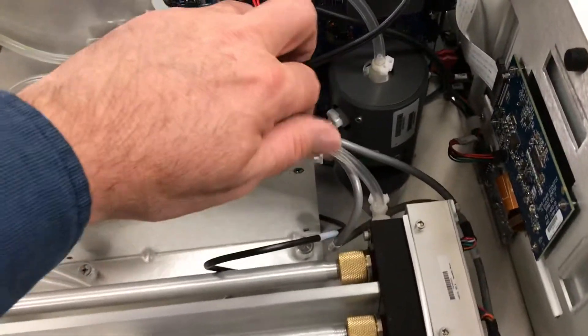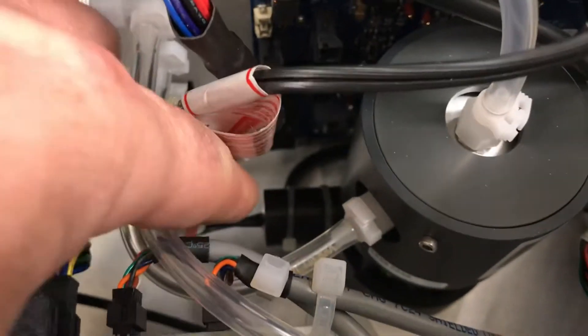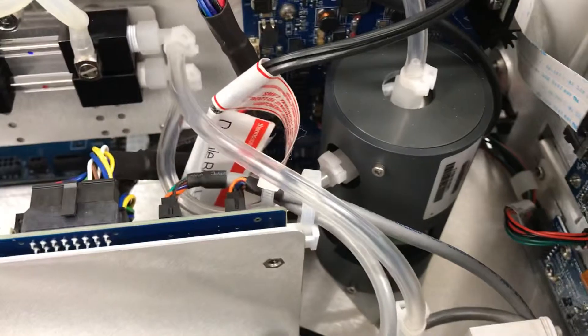Just as it was in the previous instrument, this is your daily span ozonator. There's the ozone lamp down at the bottom, and this whole chamber is your ozonator chamber to do daily span checks on this instrument.